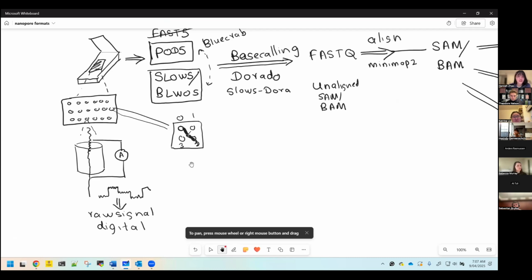Yeah, those kinds of unnecessary reads are automatically filtered by the base caller if they are not good. And if necessary, you can even give a pass threshold to the base caller. If the quality value is less than a given threshold, it will remove all those reads.